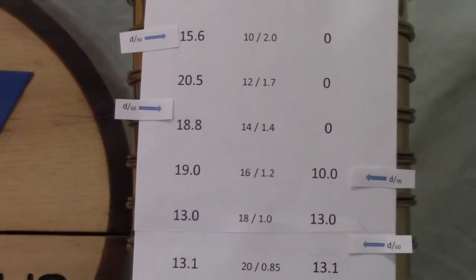As you can tell by looking at these samples, they're very different even though the effective size is the same. The sample on the right has very little large material. The sample on the left has quite a bit of large material. Uniformity coefficient helps us identify samples that have a disproportionately large amount of oversized material. This is important in water and wastewater because it's the uniformity coefficient that most impacts our backwash requirements.